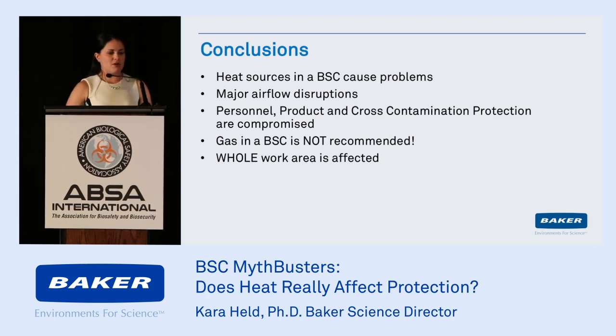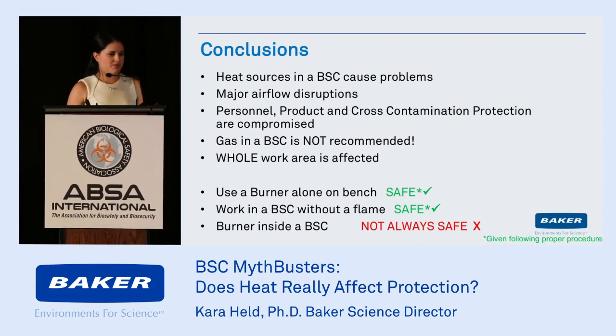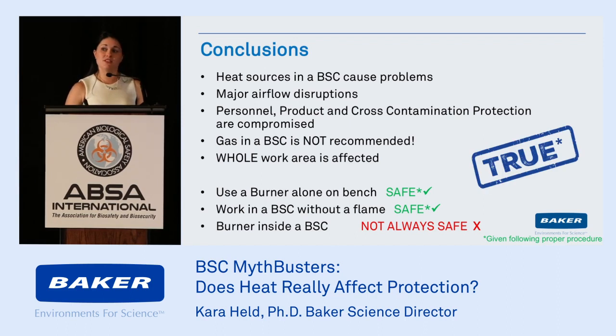A Bunsen burner alone on the bench would be safe. Working in a biosafety cabinet without a flame, safe, given you will use proper procedures. Burner inside negates both of them. You're better off doing one or the other. So we're going to mark this myth as true. You should not use heat sources in a biosafety cabinet.